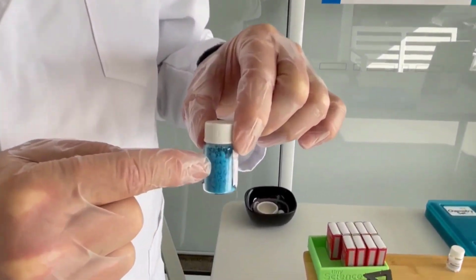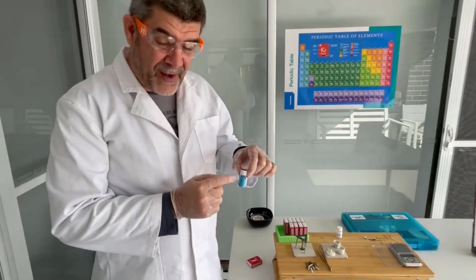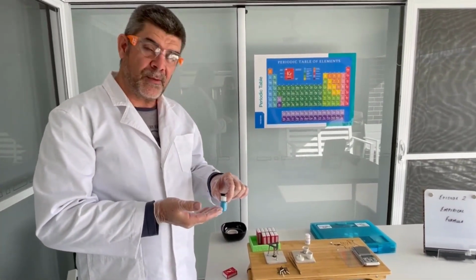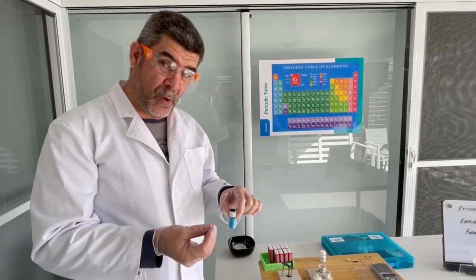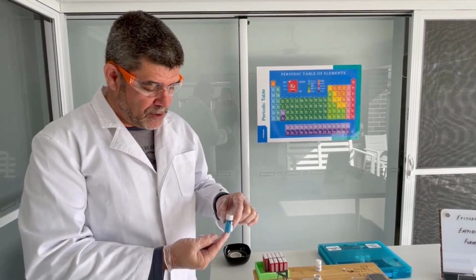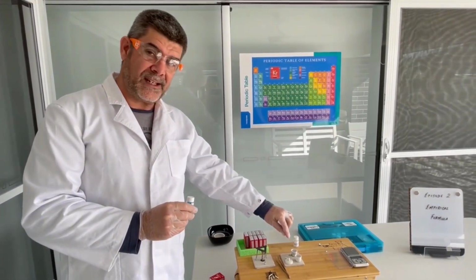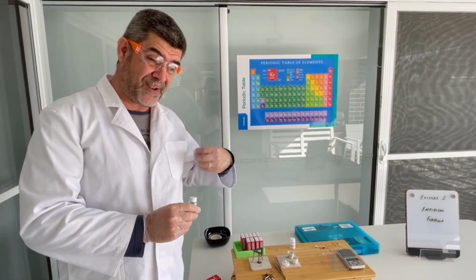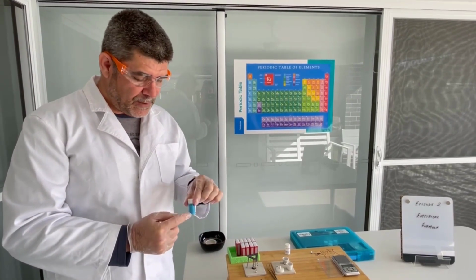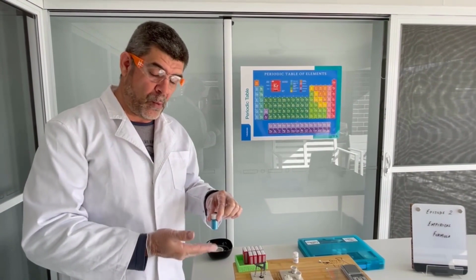We're going to weigh out a certain amount of this particular substance, but this time when we heat it, what we want to try and do is just make sure that the temperature is above 100 degrees, which means the water will boil and it will disappear from the crystal structure. So that means what we should find is this time, instead of the magnesium oxide, which was a product that increased its mass as a result of taking in another element, this one is going to lose mass because we're going to allow that water to escape.